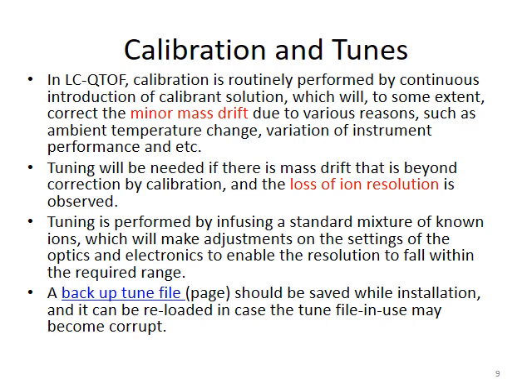So you will imagine calibration is more commonly performed while tuning is done less frequently. And likewise, calibration usually takes less time while tuning is more time consuming. And all the changes after performing either calibration or tuning will be updated to a tune file.